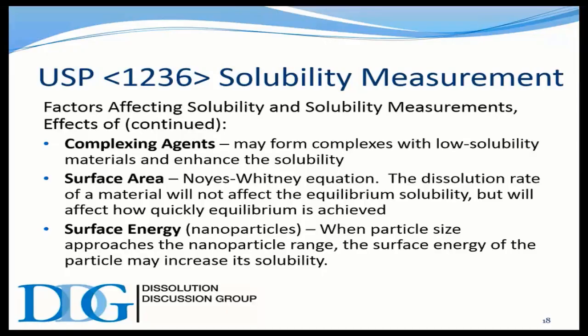Even though the surface area will not affect equilibrium solubility, it will have a huge effect on rate and how quickly equilibrium is reached. And as Vivian showed, if it's a wide distribution of surface area, of course, you can have a lot of sway in how fast it's going to release, which would not be a desirable situation in the manufacture of pharmaceutical products.